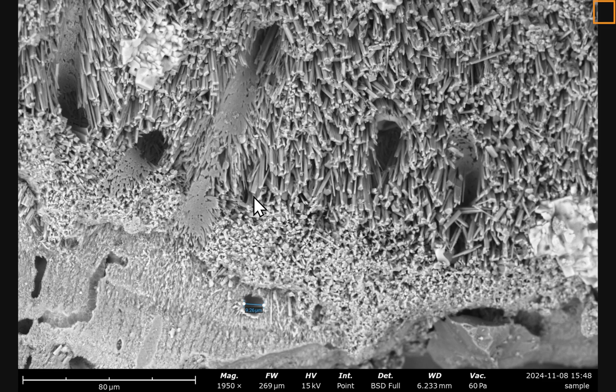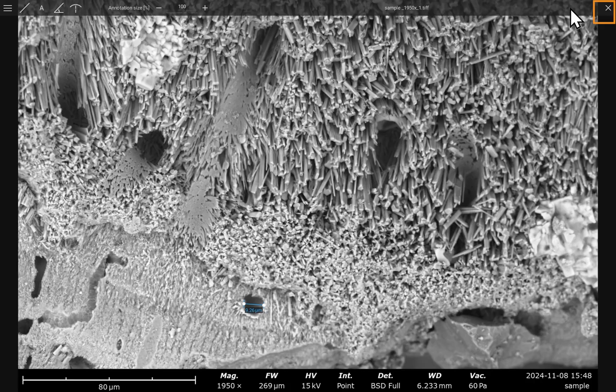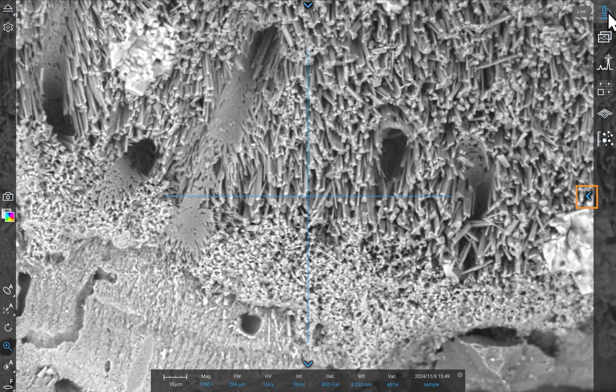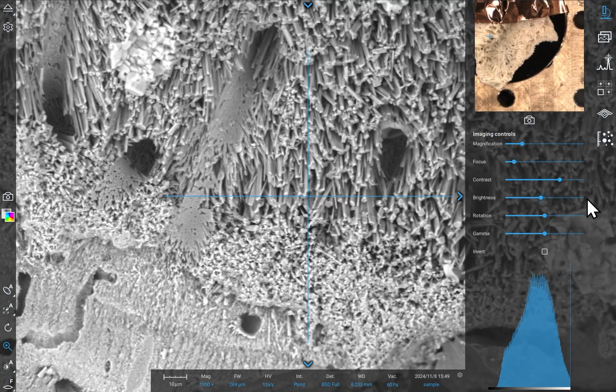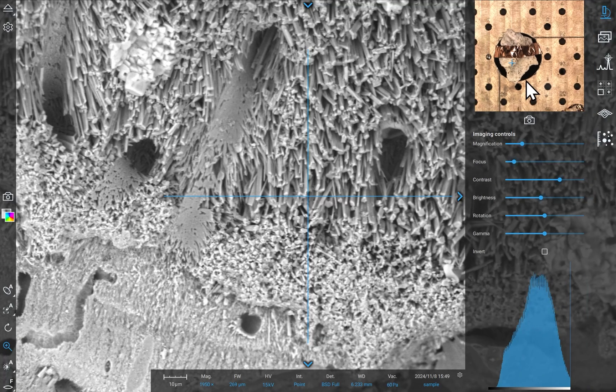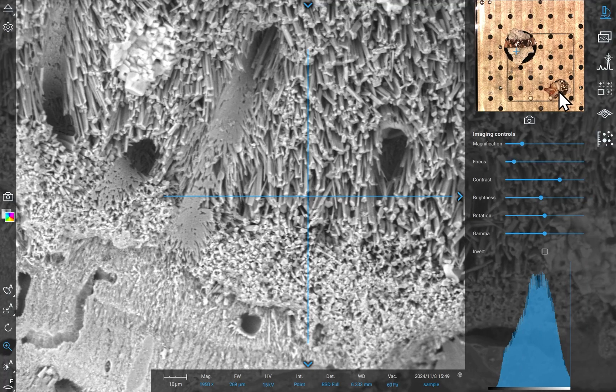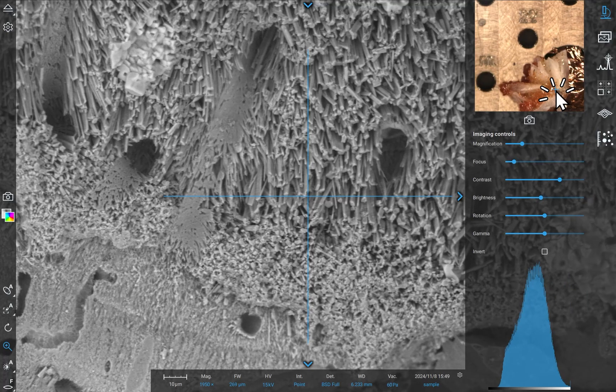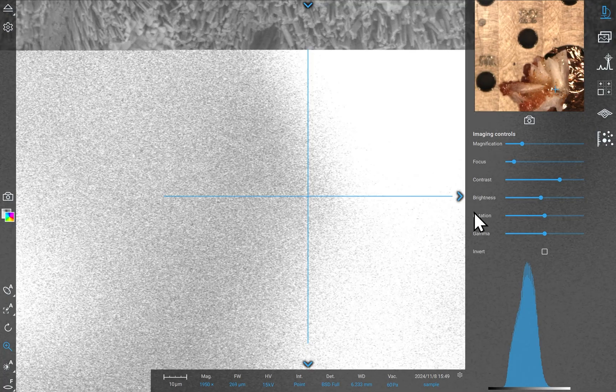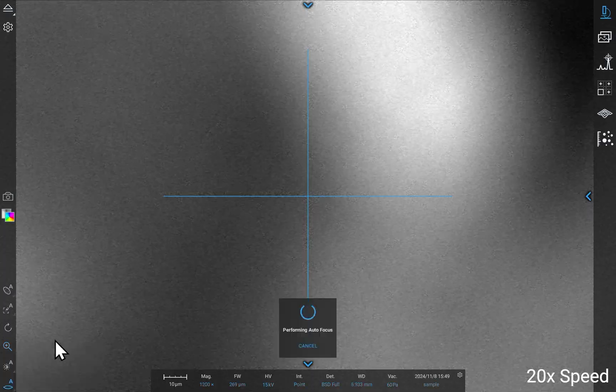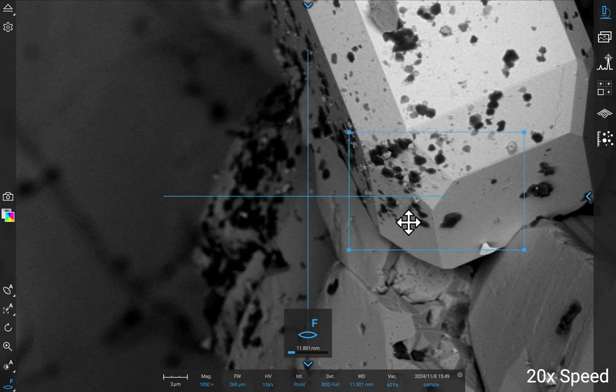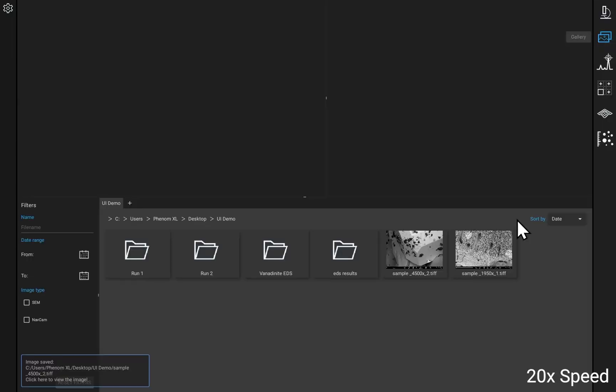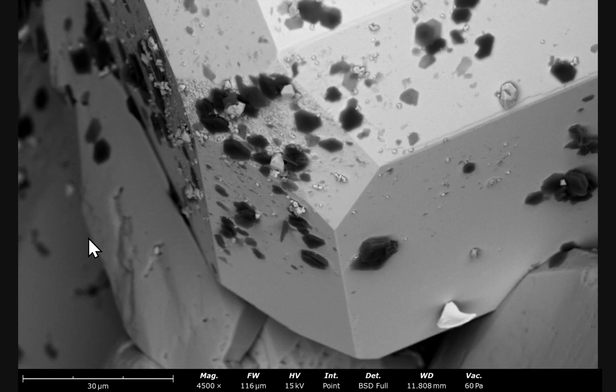To change samples using the navigation camera, click on the blue arrow on the right. Click on the desired location in the navigation camera view, and the sample will be moved under the electron beam for imaging. Repeat the process we used on the first sample and capture your image.